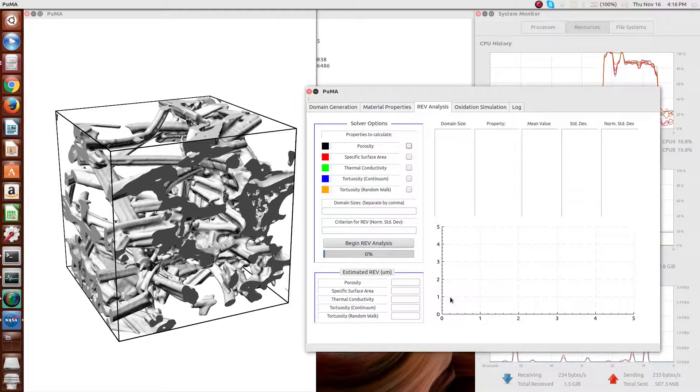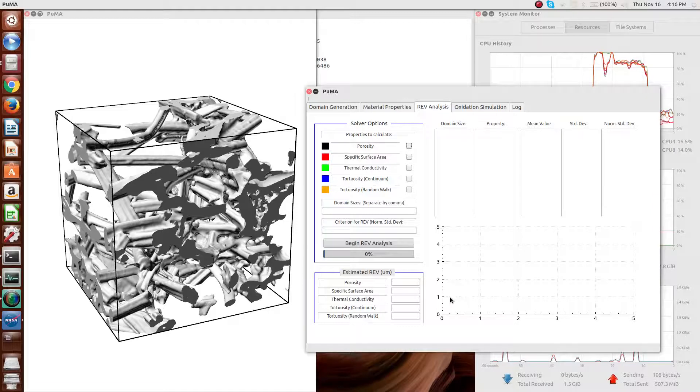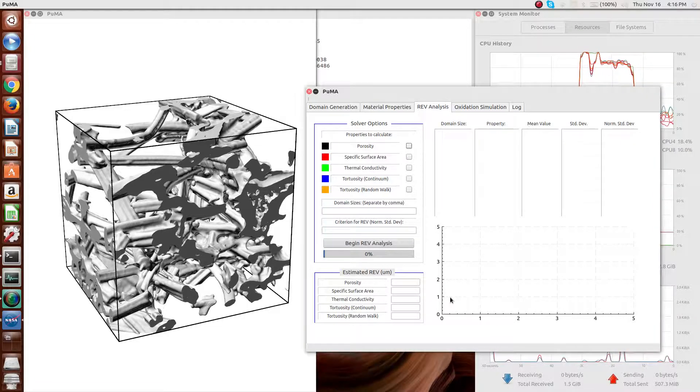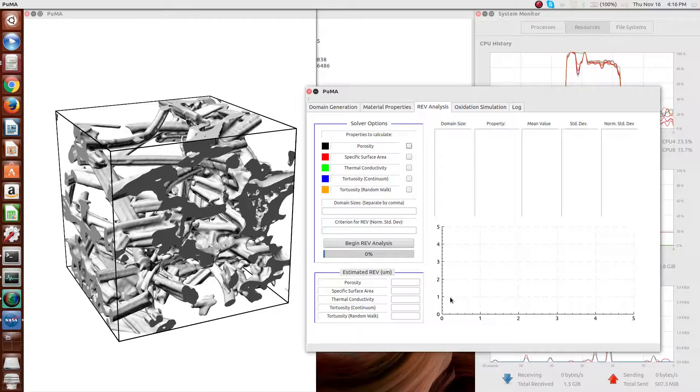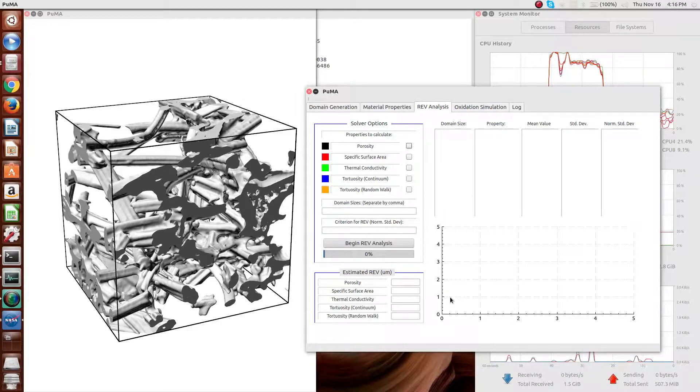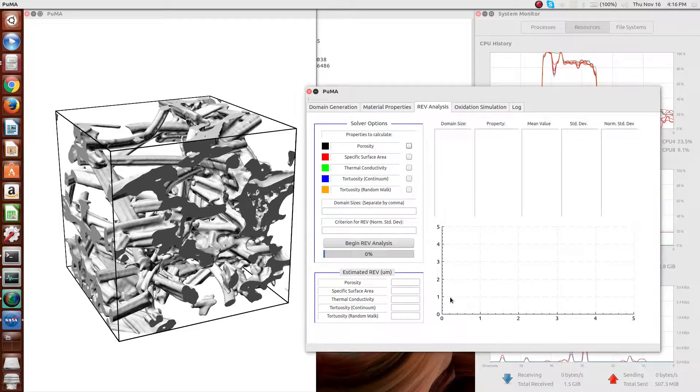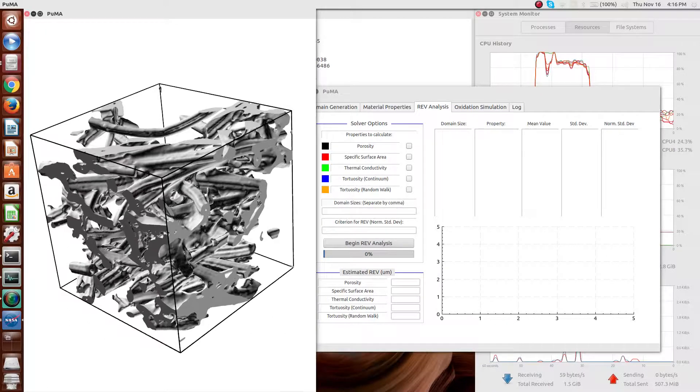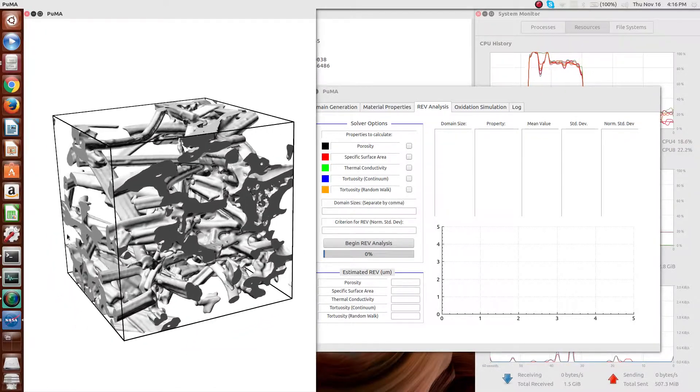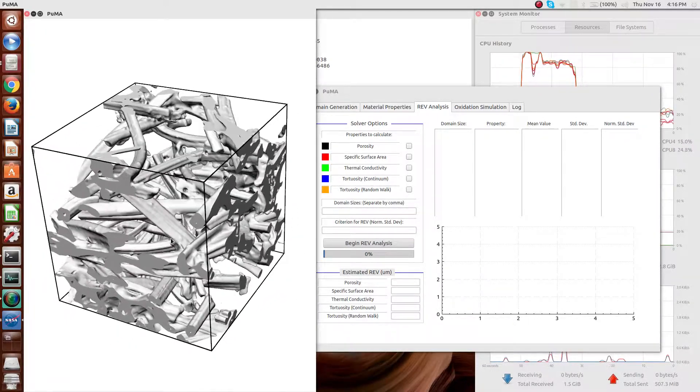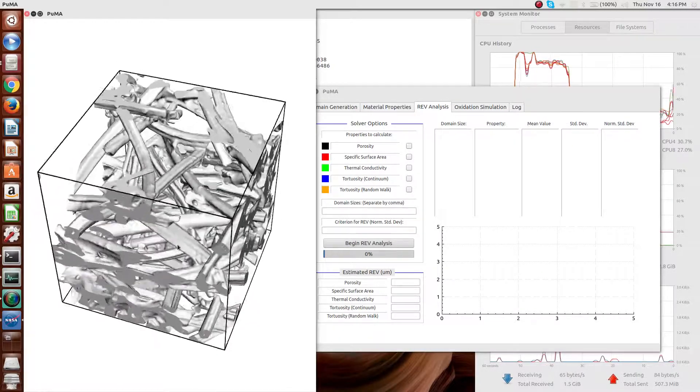The next aspect of the code is representative elementary volume analysis. What this basically means is that for any given property, you are interested in knowing what the sensitivity is in terms of, is this sample that I'm taking representative of the overall material? In the case of the image you see here on the left, it is, of course, not. This is a very small subset, just so I can run the simulations quickly for this video.